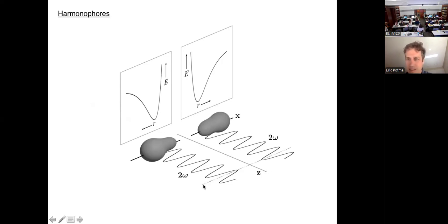And if I now detect these two waves on my detector, let's say my detector is this dotted line here, you see that these waves are out of phase. In other words, I don't see anything because they destructively interfere. All right? So this is important. That means even though these two molecules are individually able to generate a second harmonic generation signal, which is true for almost any biomolecule, if they are organized in such a way that they compensate one another in space, nothing comes out. And it turns out that is unfortunately true for almost all biological structures.